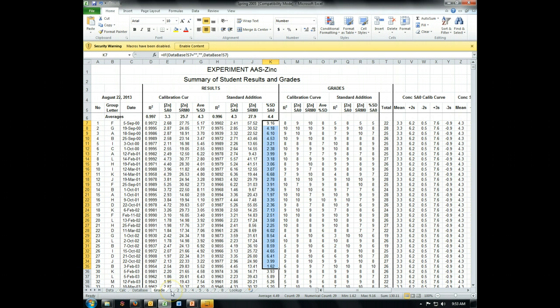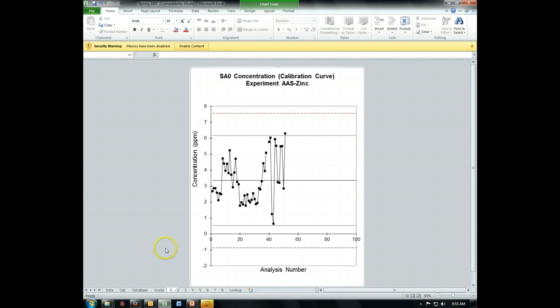Now let's look at these quality control spreadsheets. Now typically what you do, you plot them all up. You take the average and you put a line for the average. Then you're going to show a 2 standard deviation limit and a 3 standard deviation limit. The 2 standard deviation limit is treated as being the spot where things are getting out of control, but there's still a decent chance that that could happen from random luck alone.